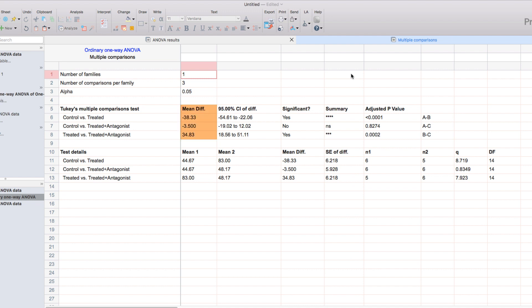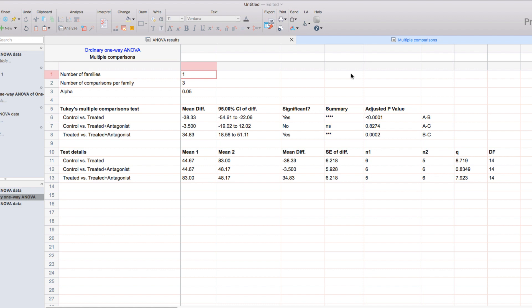Including the difference between their averages, the 95% confidence interval of that difference, the calculated p-value for the difference, as well as the summary of significance. In addition, we'll have the test details that indicate the average of each group, as well as the sample size for each specific group.